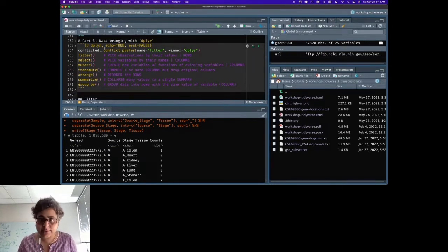So, Janani, yes. Sorry, while you are showing how to do the data wrangling, if you just go back a step, someone is a bit confused about the data. We are using tab delimited files now, but he was wondering how you went from a BAM file to the TSV. I think he is not sure if you can elaborate about data formats and how you use them inside transcriptomics analysis. Okay. If I understand right, you're asking me how to get from the tab delimited data format into R and into all the other operations that I'm doing. Yeah, so that's the question.